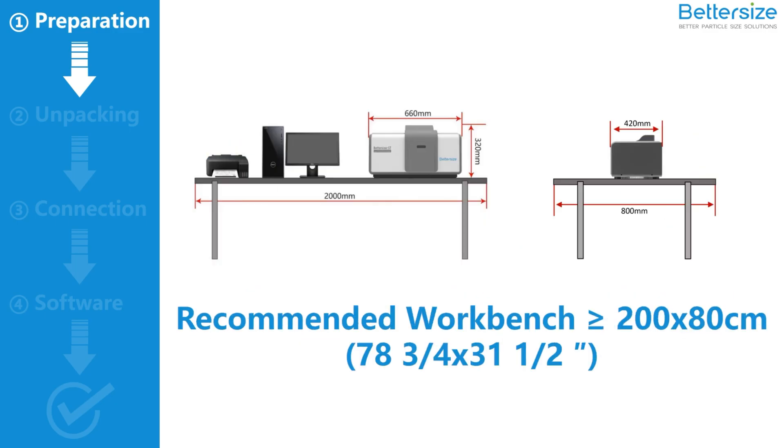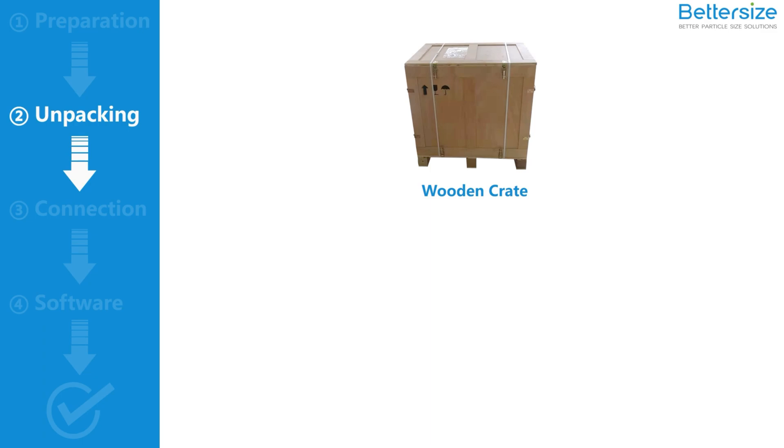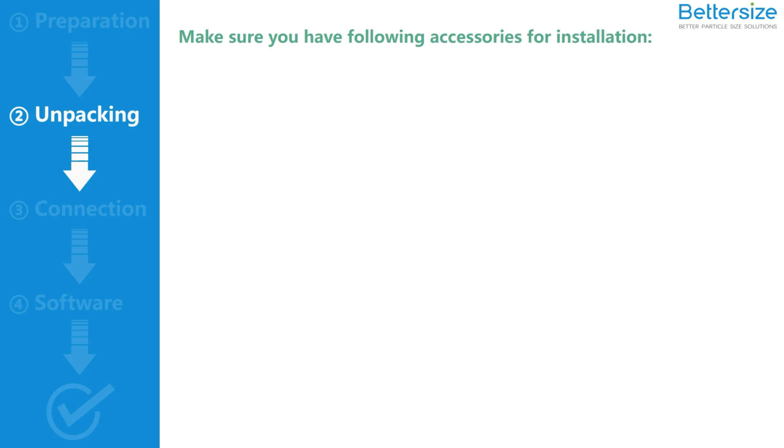The workbench should be rigid, and its length and width should not be less than 200 by 80 centimeters. After the preparation, unpack the wooden crate from the side. You will find a carton and a black service kit. The Bettersizer ST is in the carton — take it out carefully. The service kit contains various accessories for installation and maintenance.